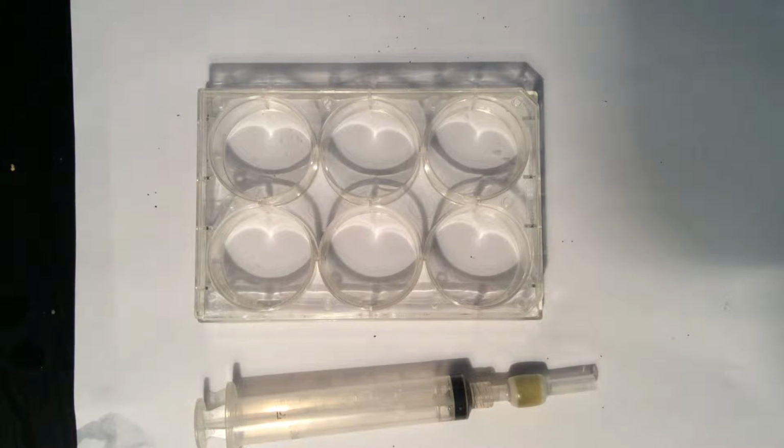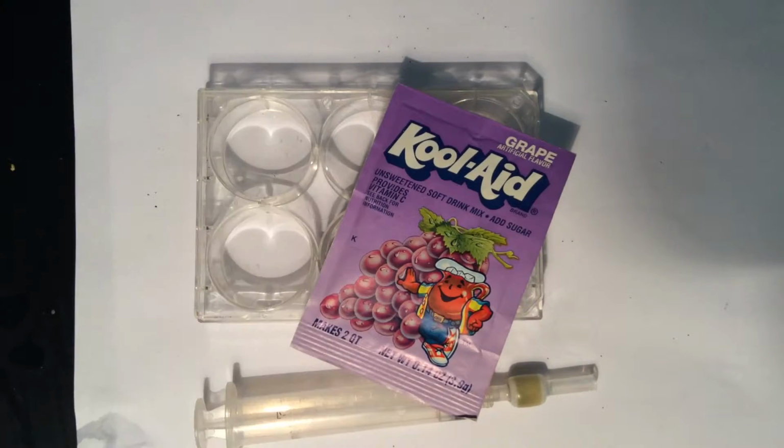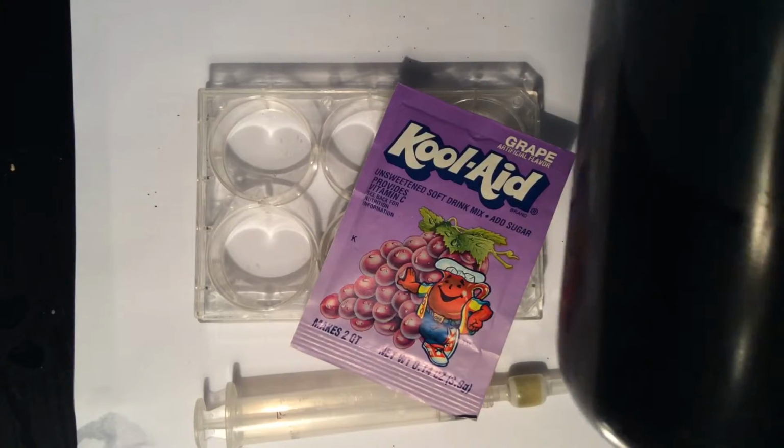So what I'm doing today is column chromatography, a very classic demonstration, and I'm going to use grape Kool-Aid. Grapes are always purple, correct? At least in their coloring scheme, grape Kool-Aid has a purple color to it. This is just some grape Kool-Aid that I have mixed. I didn't put any sugar in it.